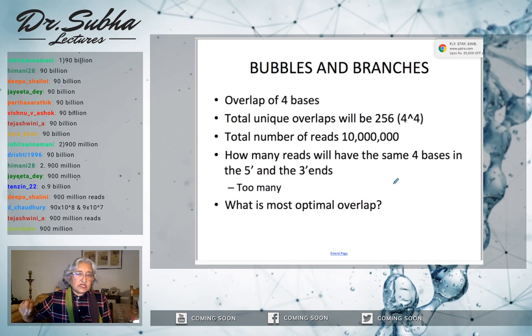And that is the reason why I said just alignment based assembly is not good enough for metagenome. There are very many methods people use to correct for closeness of the species, because you will form chimeric reads: the assembly kept extending, picked up from the closely related species and went back into that species. How do you break the chimeric reads? Those are things we'll learn a little later. But right now, we are just talking about alignment based assembly, which applies to any genome sequencing, not just metagenome. So we'll wait to answer those questions later.